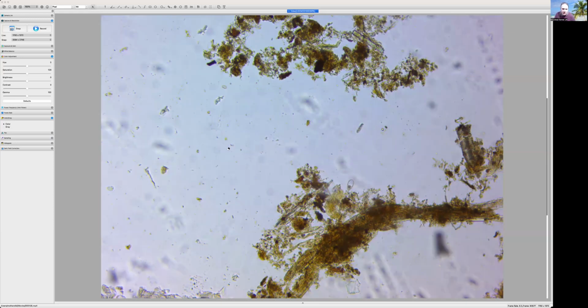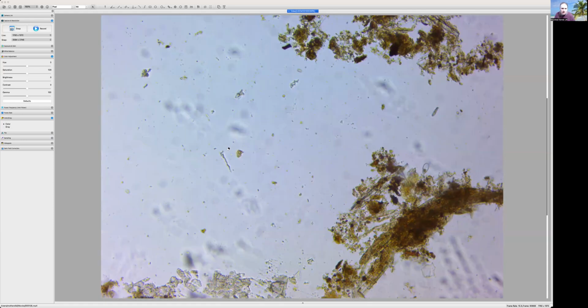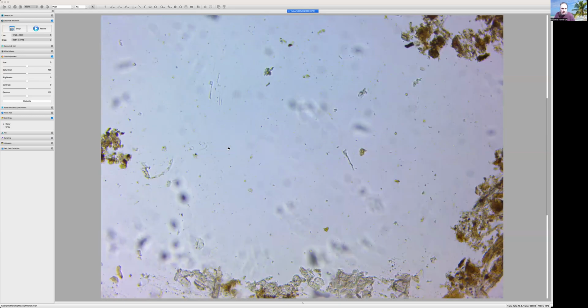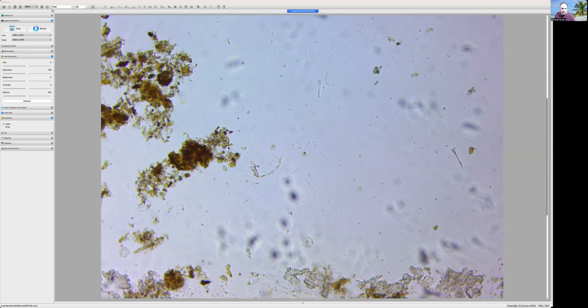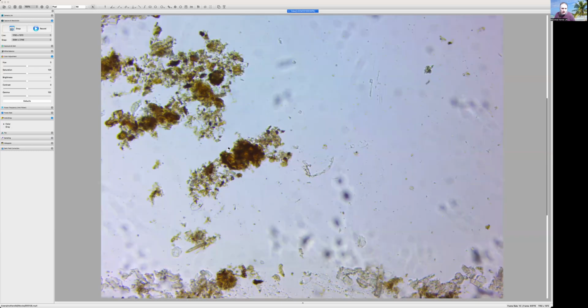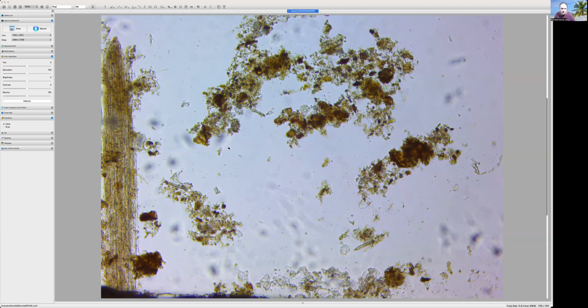My, oh my. This was an active spot over here. There's another stalk ciliate up in there. Oh, she grabs something. They'll grab it and then they do that.